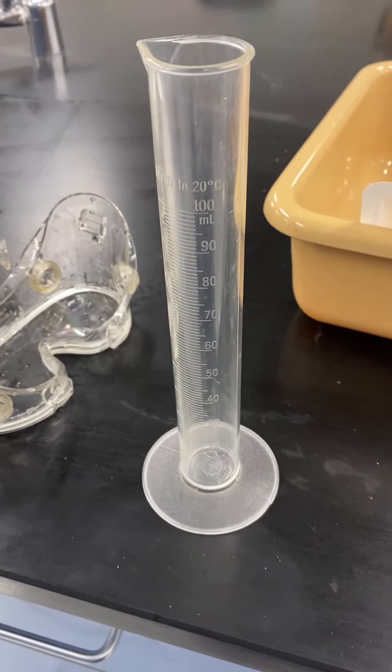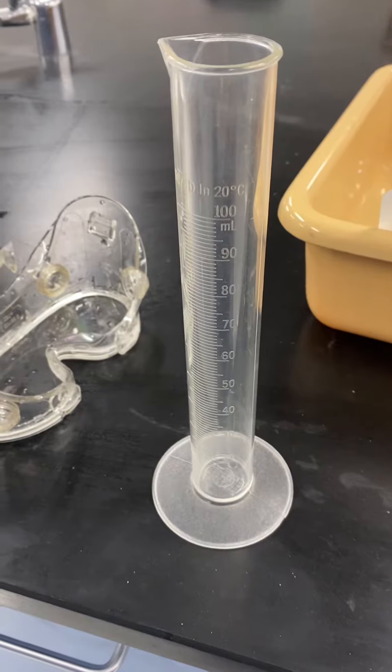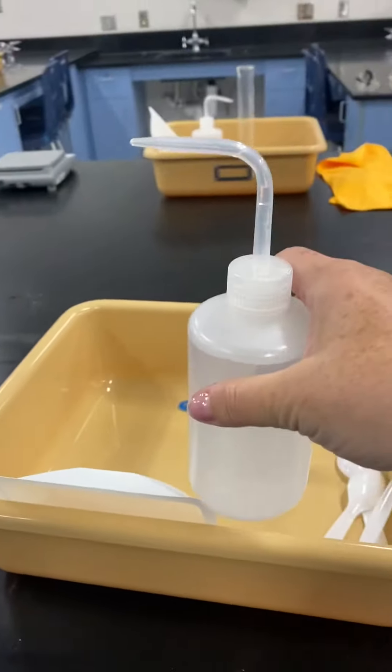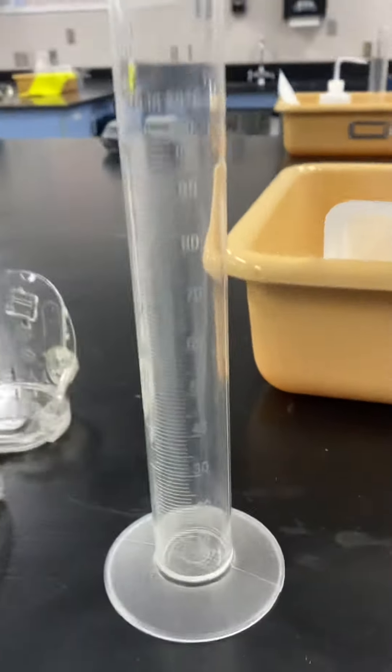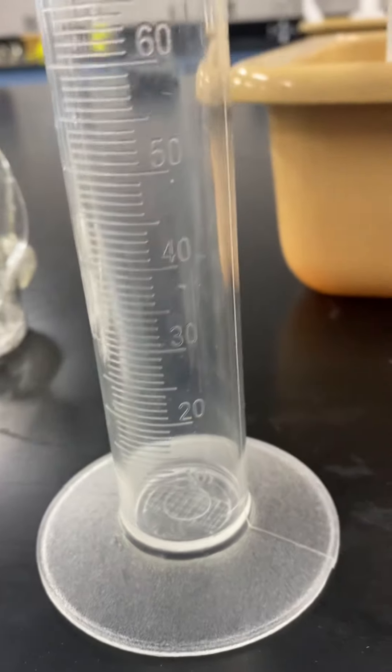I'm going to demonstrate how you are going to pour 20 milliliters of water into this graduated cylinder. So first we're going to start with our bottle of water, our graduated cylinder, and if you can see down at the bottom there's a 20 mark — that's what we want to fill up to.